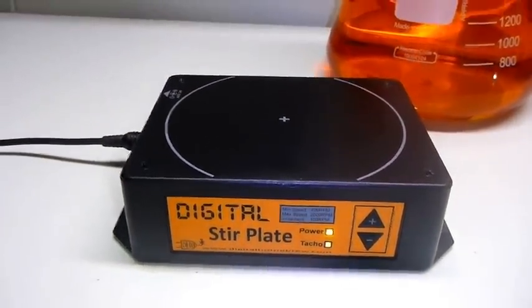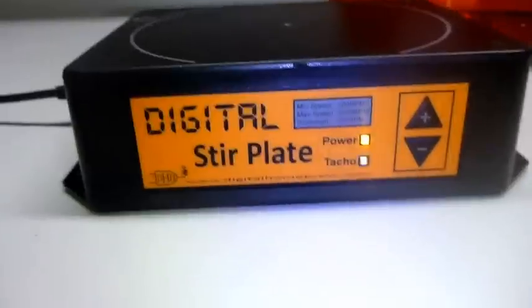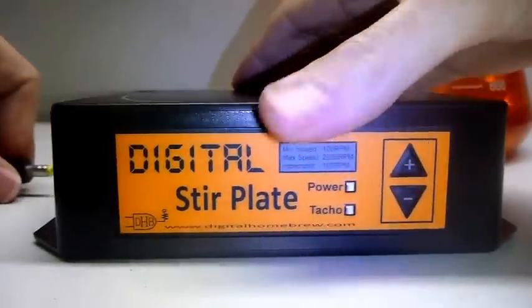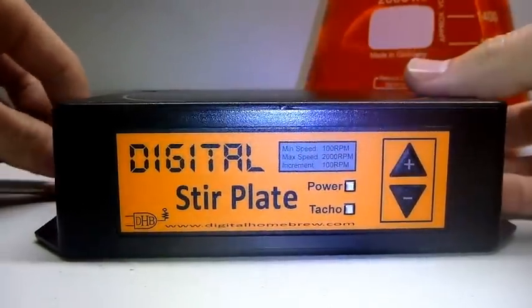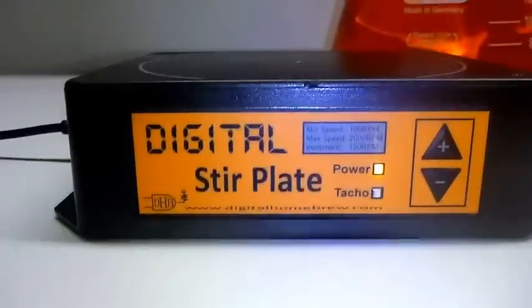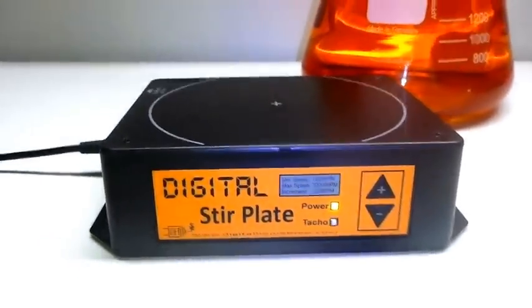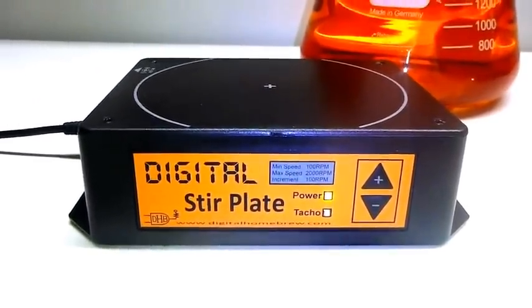Another feature we've added is an auto restart. Like an analog stir plate, if you ever had a blackout, with the old digital stir plates it forgot where it was running at and when the power came back on it was turned off. But now, as you can see, it's just started up again — it now memorizes the speed that it's running at, and in the event of a power failure it'll come back to where it was running at before.